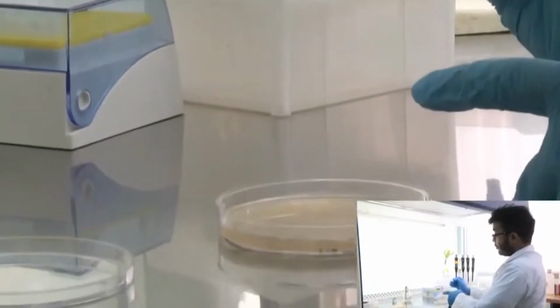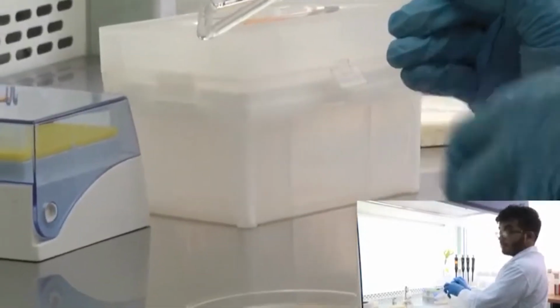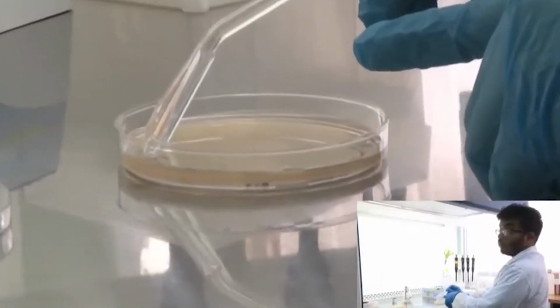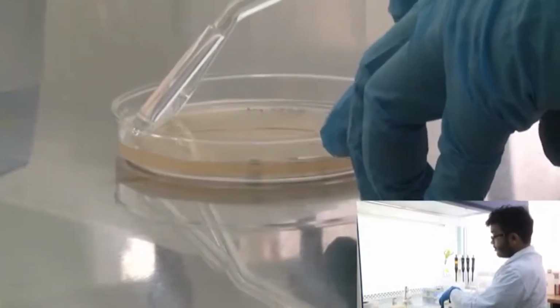Normally when you're working with Petri plates, do not touch it. I'm just pointing at it from a distance. I added the culture in the middle, so the corners do not have culture. In case the spreader is still warm, I'm just touching the culture at the corners to ensure that the residual heat gets dissipated and it comes as close to the ambient temperature as possible.